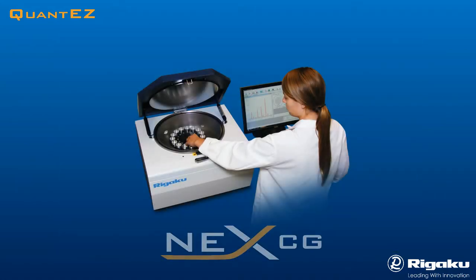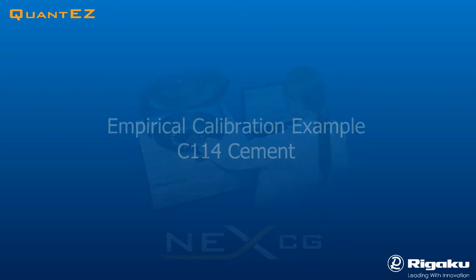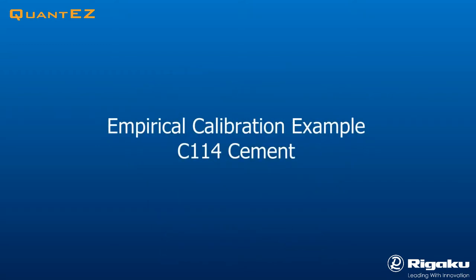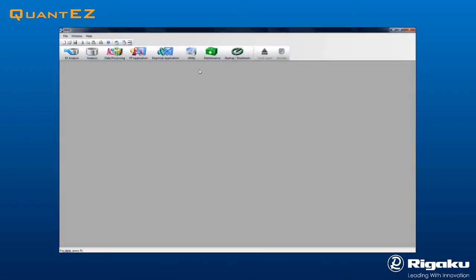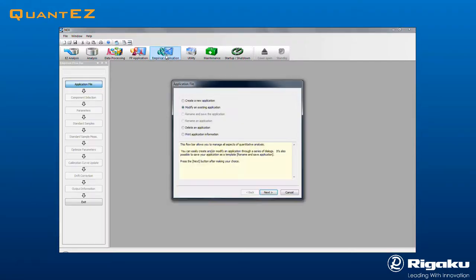Rigaku NexCG was employed for this demonstration video. Click the empirical application icon. Select Create New Application in the dialog box and click Next.